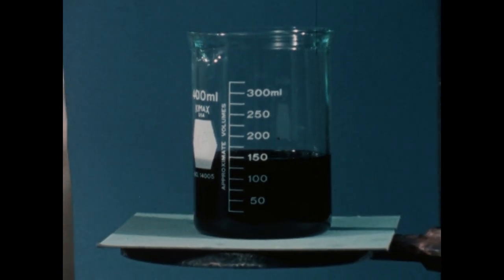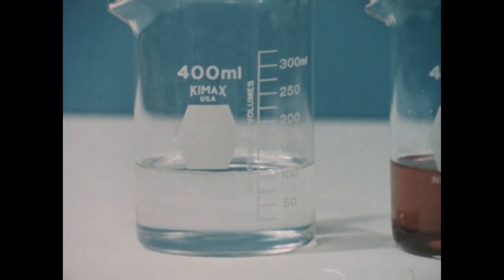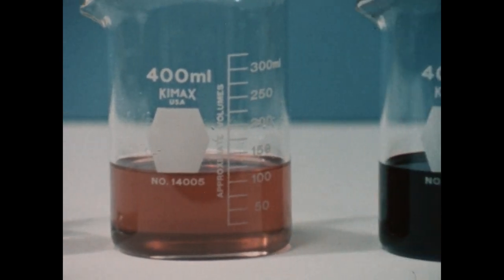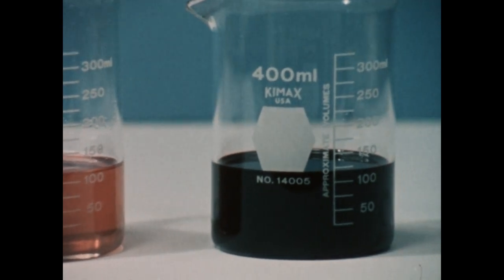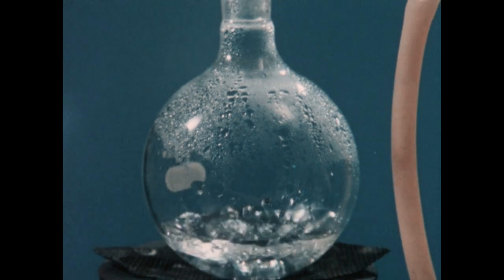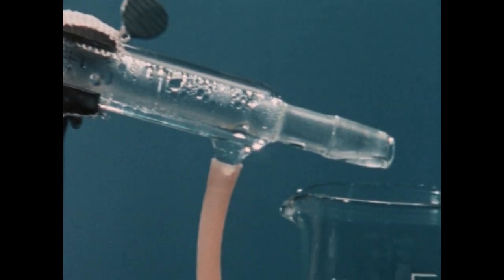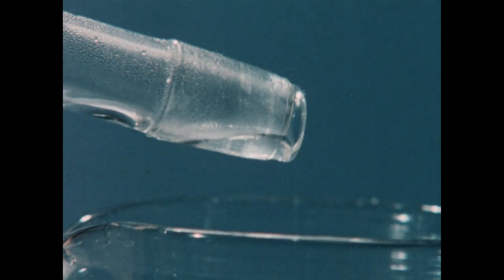And so a mixture can be separated by taking advantage of differences in the physical properties of its various parts. In our demonstration, the parts we extracted from the crude oil mixture were mixtures themselves, which could be further separated. But if we repeatedly distilled tap water, we would obtain a single pure substance, water.